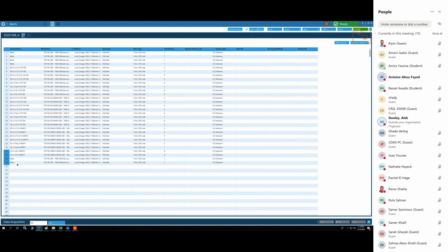And also the calibrations may fail at the beginning. The reason for that is not the instrument, but the calibrant solution is different and it may not have fully purged out of the ion source. So if you are going to do positive and negative in the same batch without any human intervention, 3 or 4 blanks is probably a good idea.